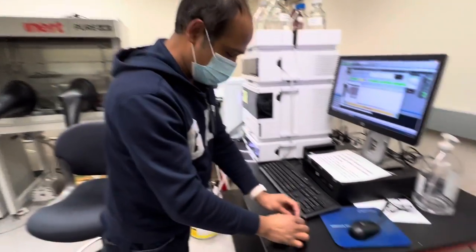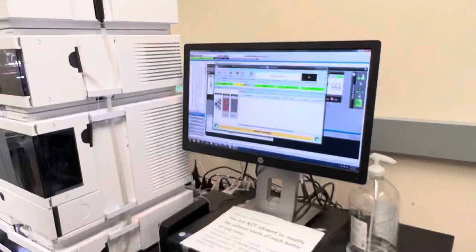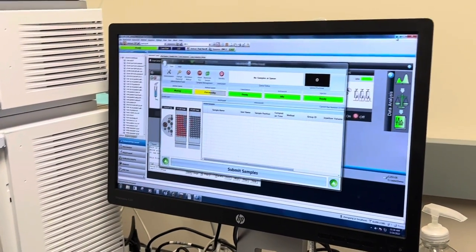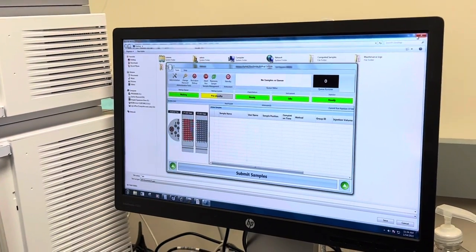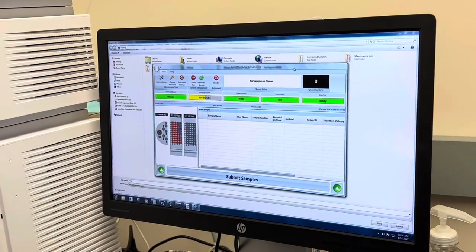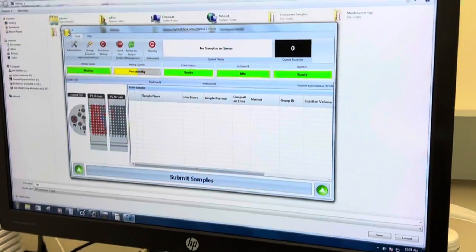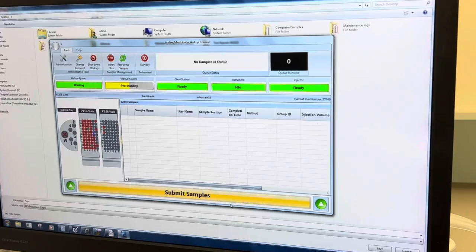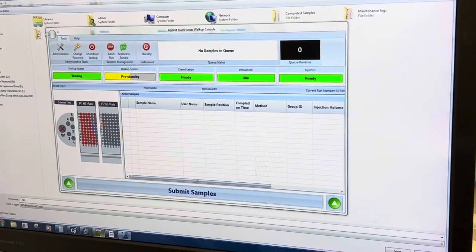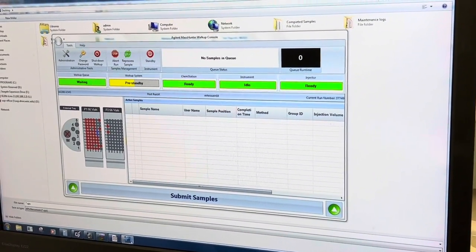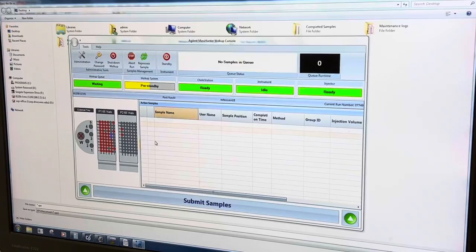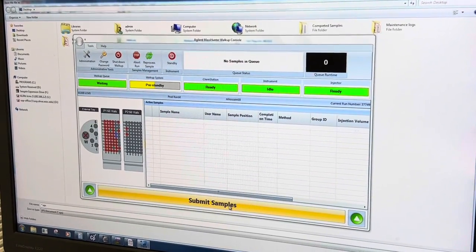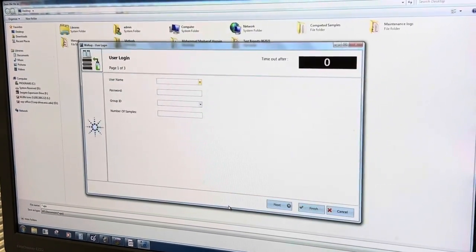If you don't see anything like this sometimes, you might see just this one, so this like submit sample, okay. So click this.